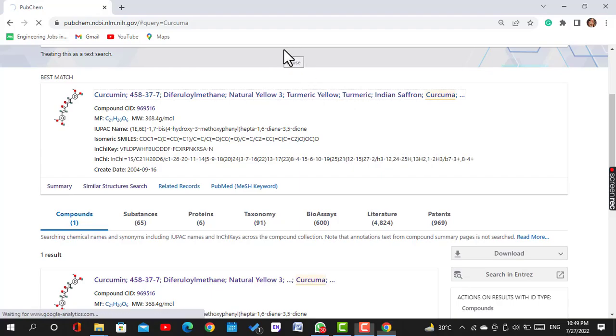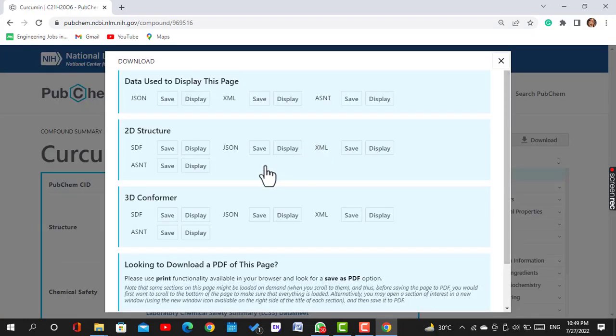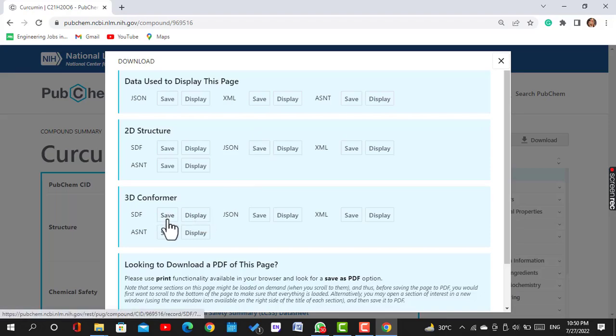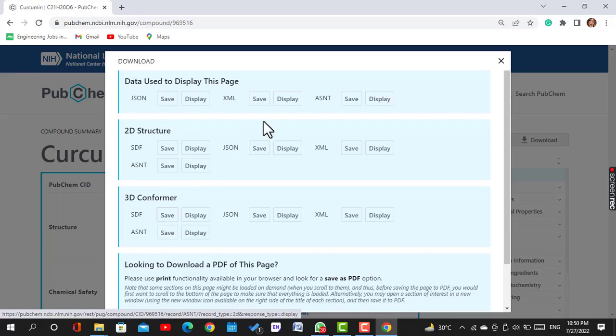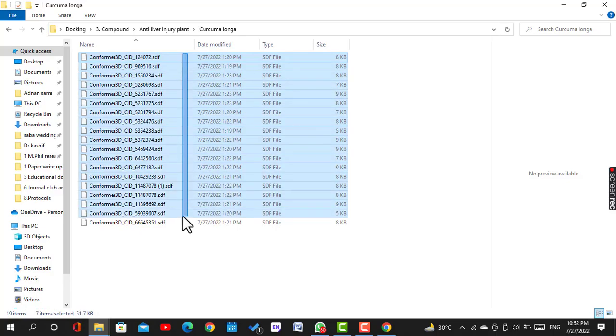Now we click on it and save its 3D structure. This one is the 3D structure in SDF format. Just like that you can download all of your desired compounds.